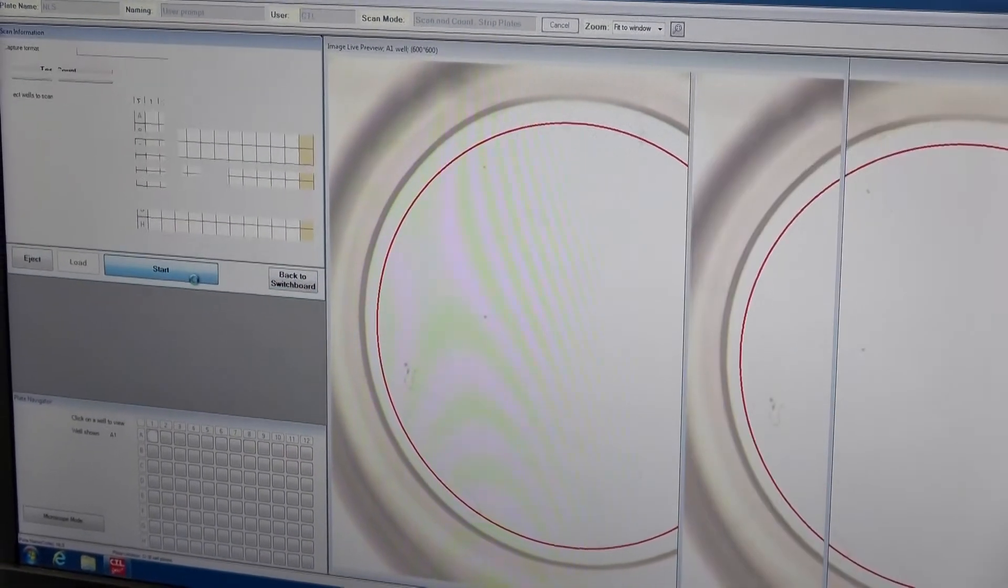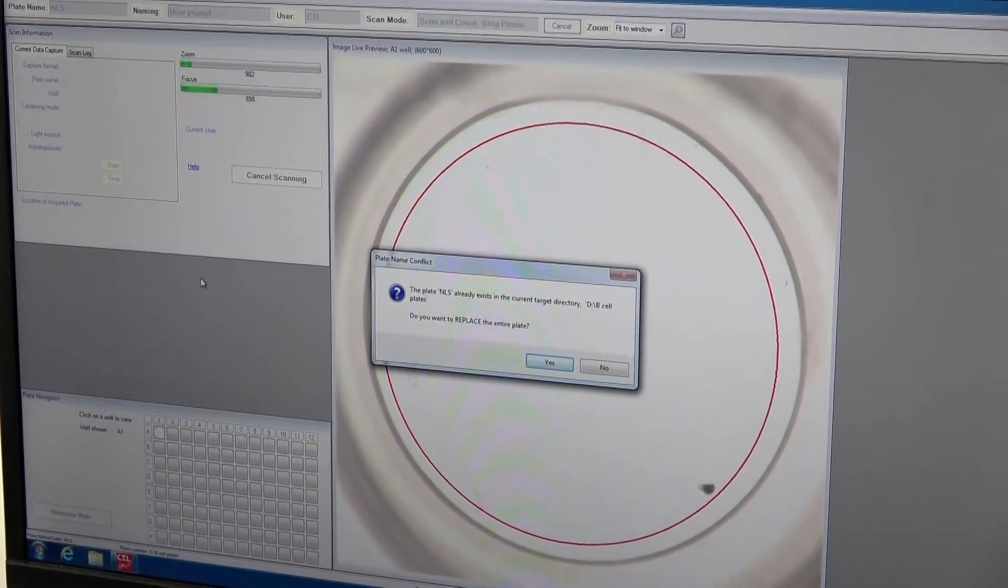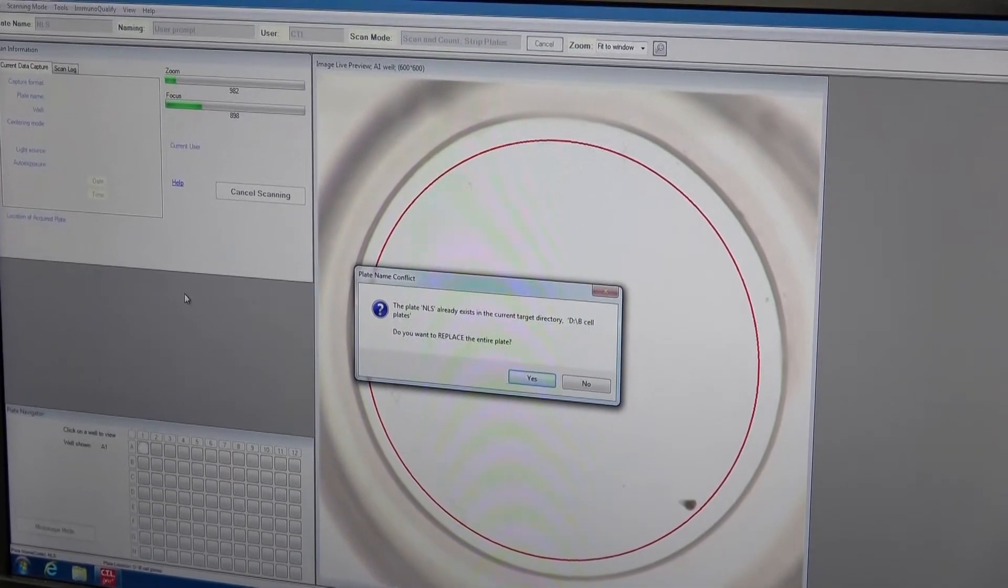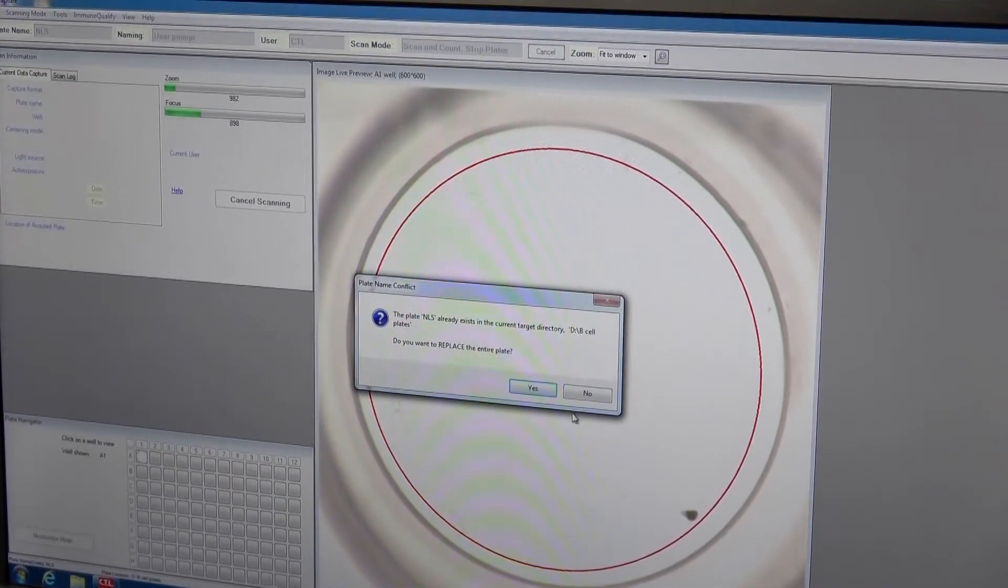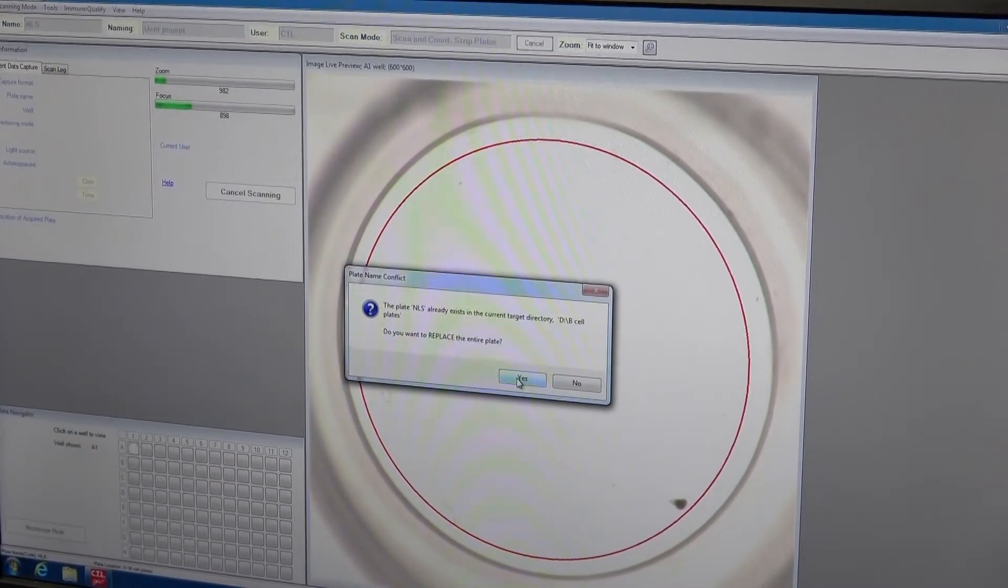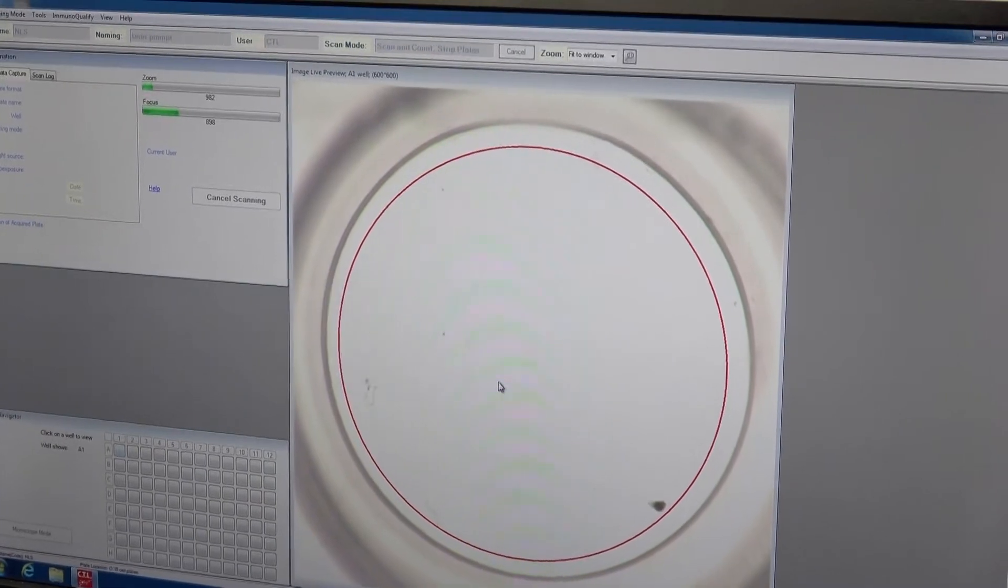We tell it to start. Since we already have a plate named NLS in there, it asks if we want to replace that plate. Yes, I do.